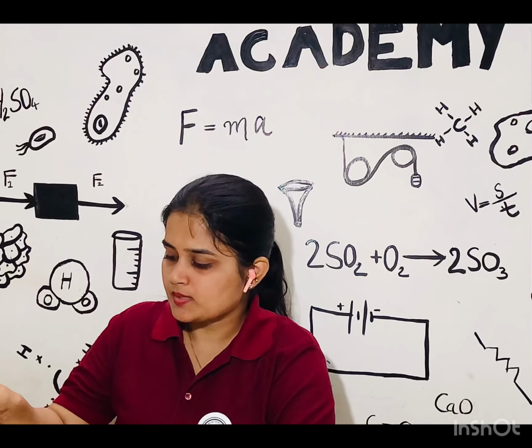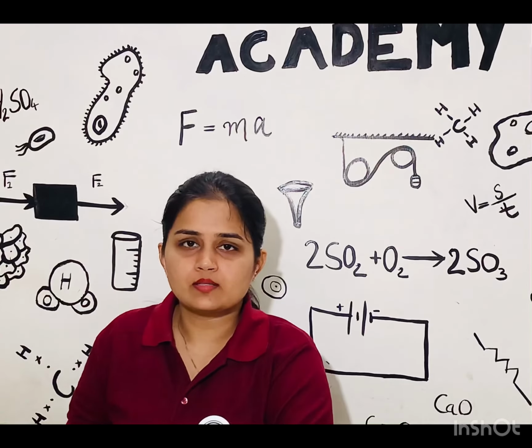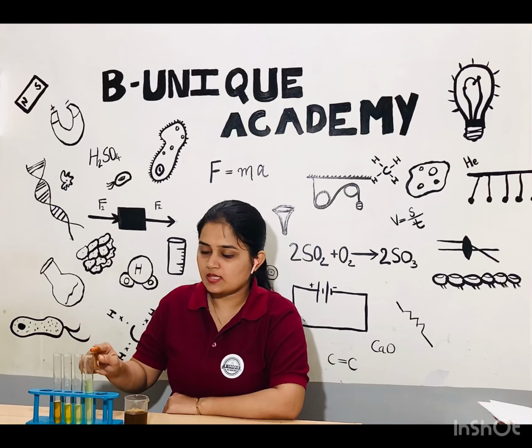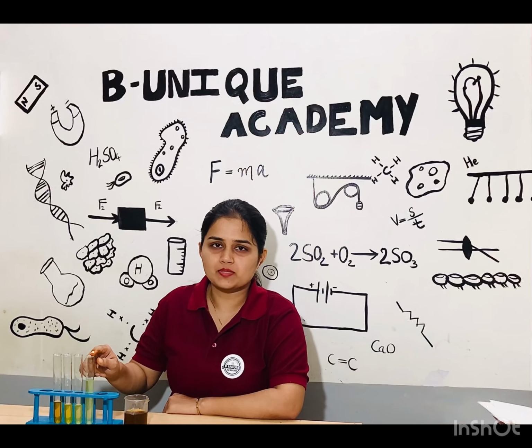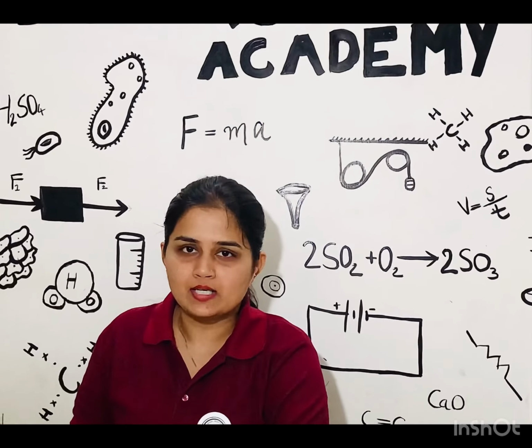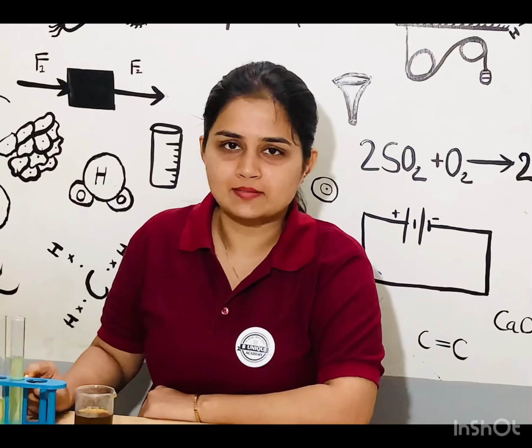Stirring the test tubes properly and putting it aside, I can see that the particles of matter are so small that they are visible even in the fourth test tube after repeated dilution. Also, these particles of matter are diffused in liquid. Diffusion is a process of intermixing of particles of matter.